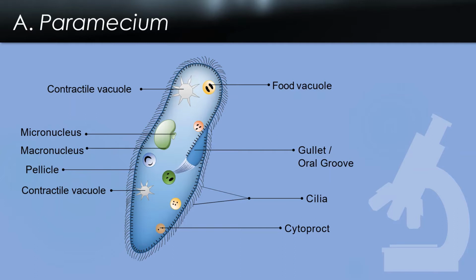Lastly, I want you to figure out what the motility structures are, and that's going to be part of your discussion for this report.